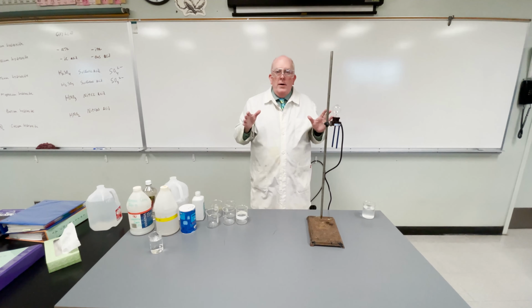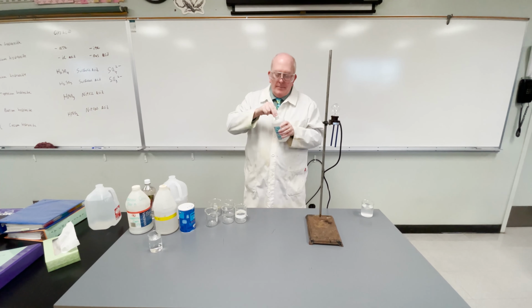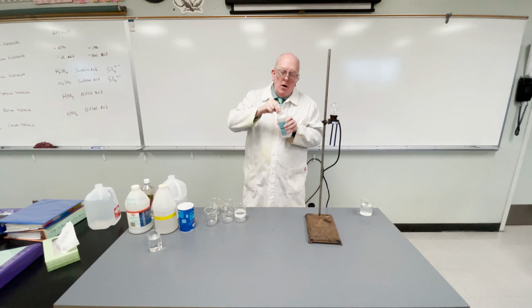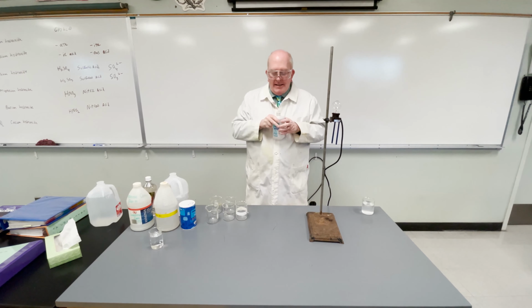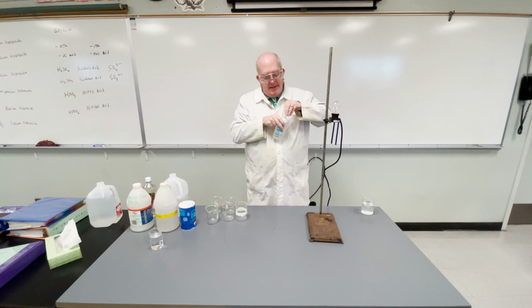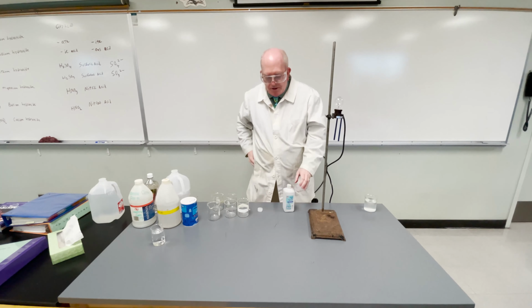Now, my next bottle here should look familiar to most of you. It is just rubbing alcohol, or isopropanol, okay? And this rubbing alcohol is covalent, okay? It is not going to conduct electricity because there are no ions that are available in there to do it, okay?